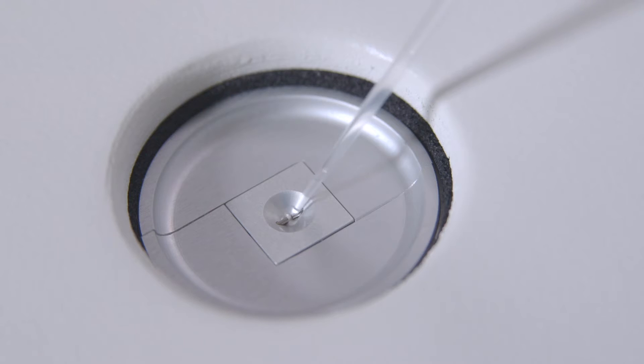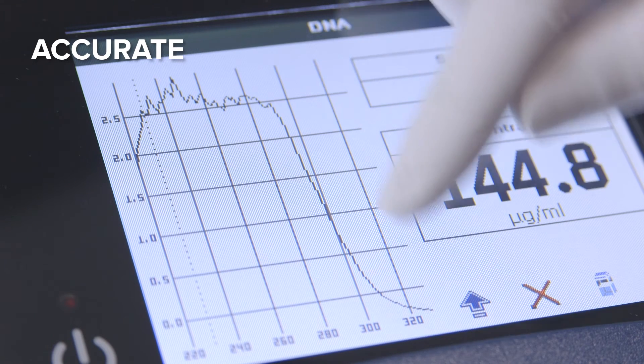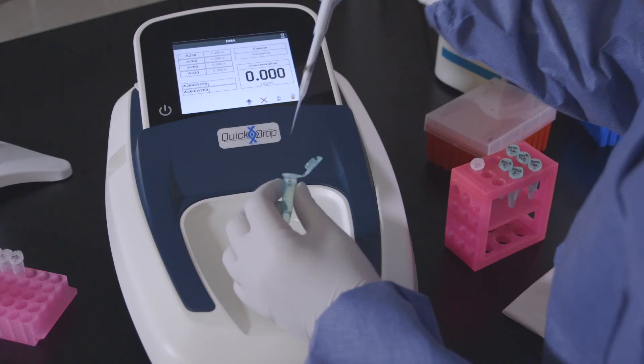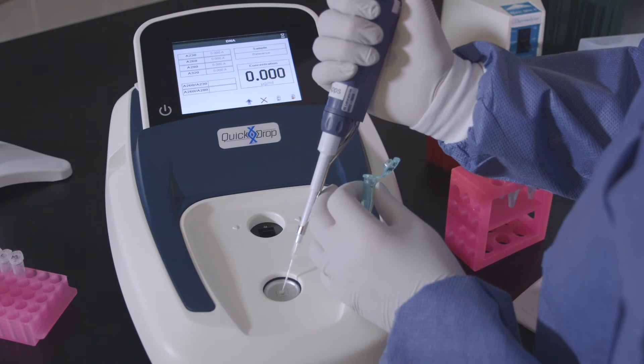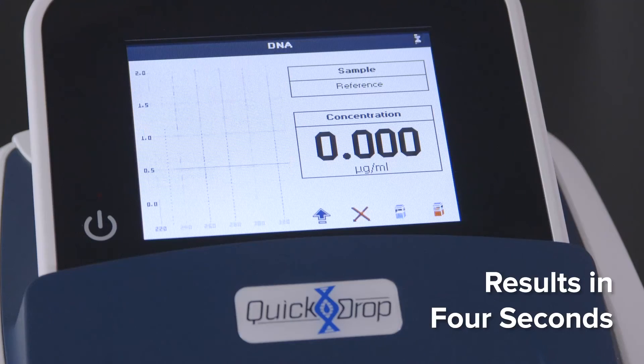Reliable reproducibility regardless of sample viscosity. High-quality optics give the QuickDrop a broader absorbance range and superior contaminant detection. The QuickDrop spectrophotometer is able to sample volumes as low as 0.5 microliters.